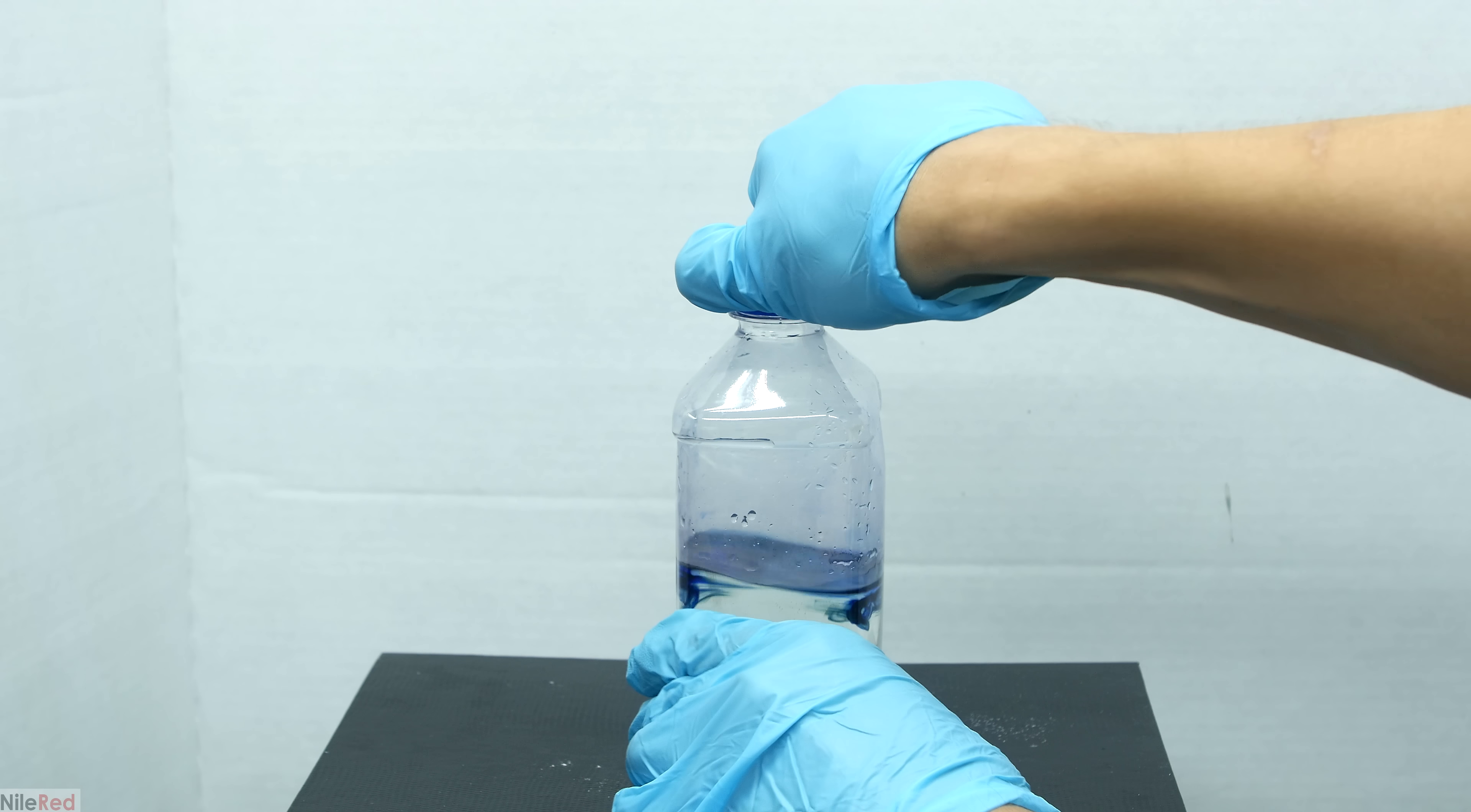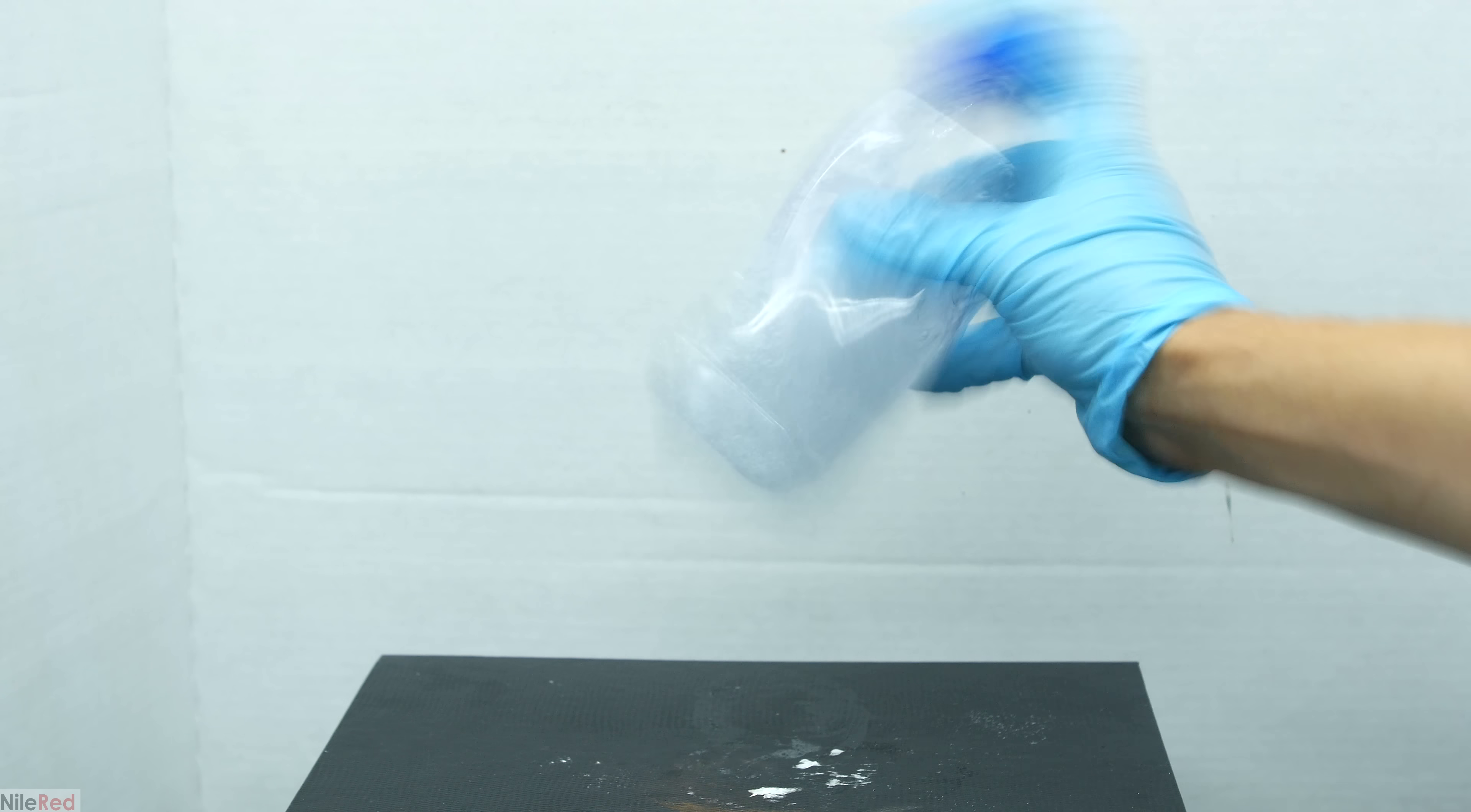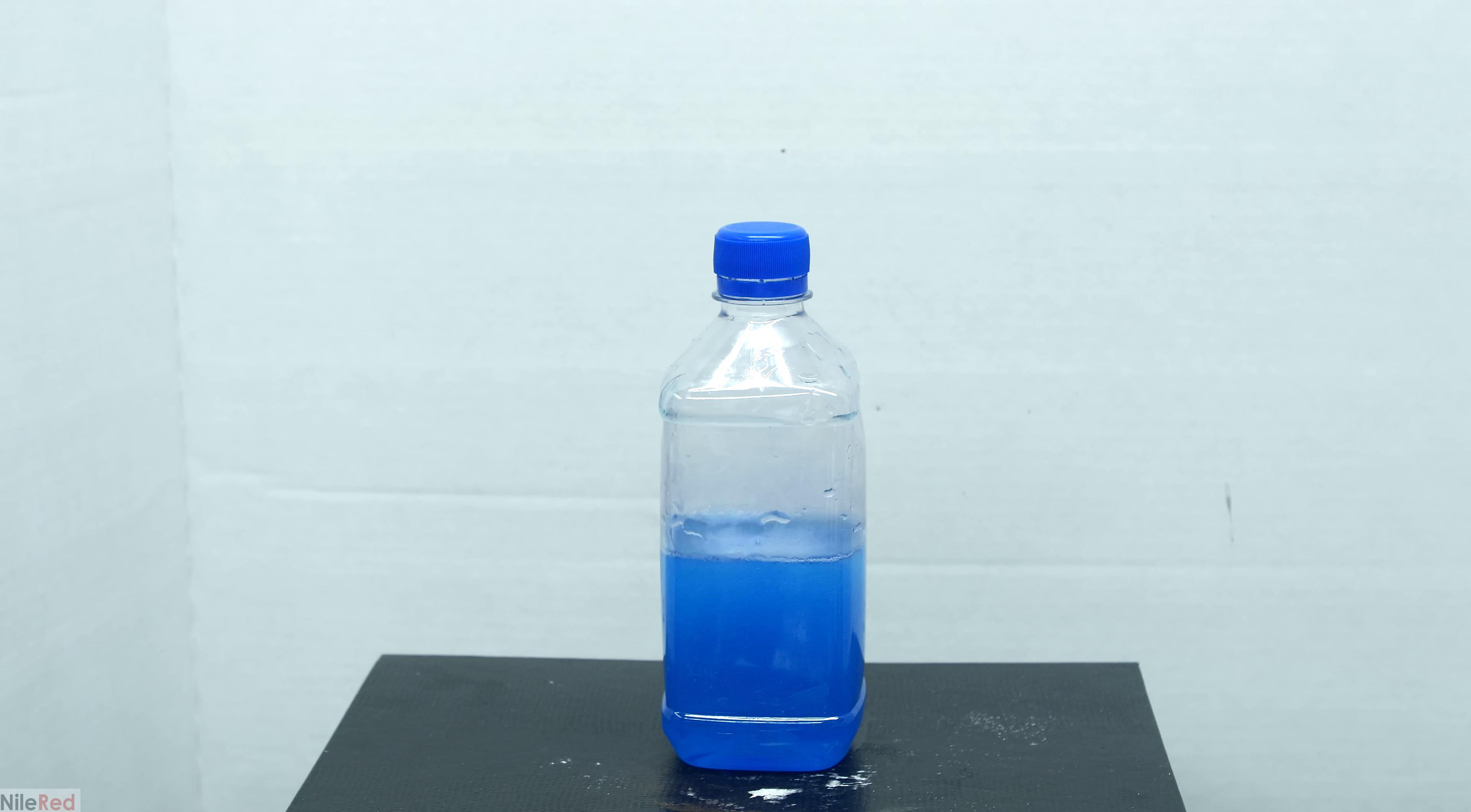The topic of today's video is the blue bottle demonstration. It's a pretty cool demonstration where we start with a colorless solution and when we shake it, it turns blue. If we then leave it somewhere undisturbed, the blue color will disappear and we'll be back with a colorless solution. We're going to first prepare the demonstration and then talk about how it works.